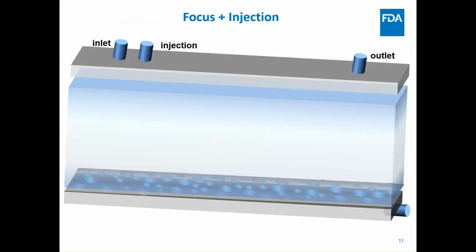So next, I want to talk about how the samples are separated inside the AF4. As I said, the AF4 can be considered a chromatography type of separation. A lot of the equations to calculate the retention, the resolution, and the capacity are almost the same as column chromatography.